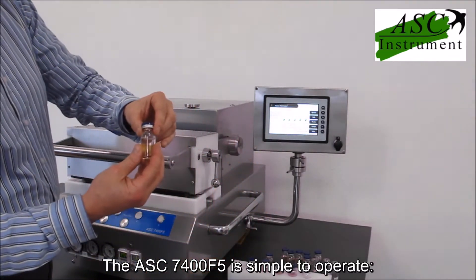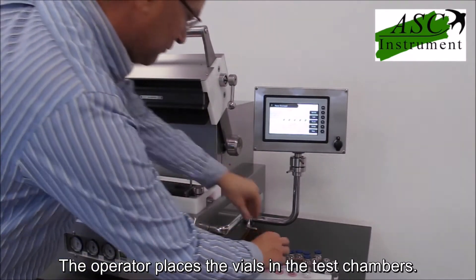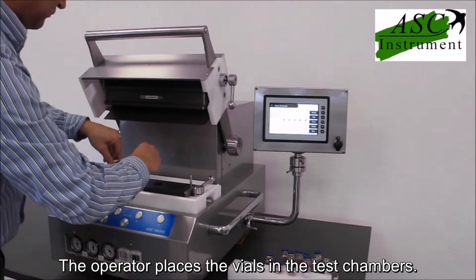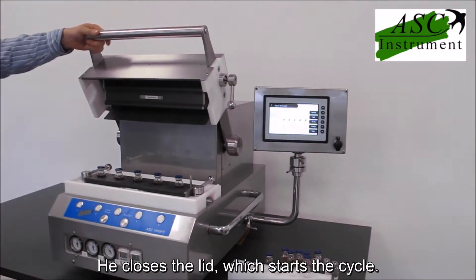The ASC7400F5 is simple to operate. The operator places the vials in the test chambers, closes the lid, which starts the cycle.